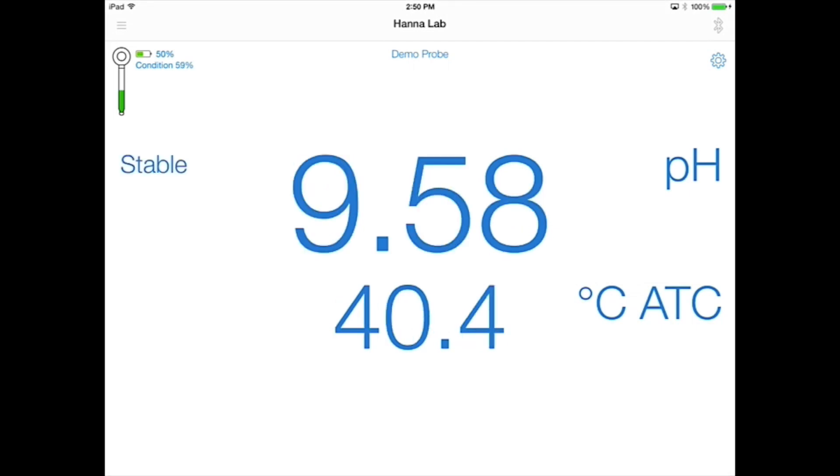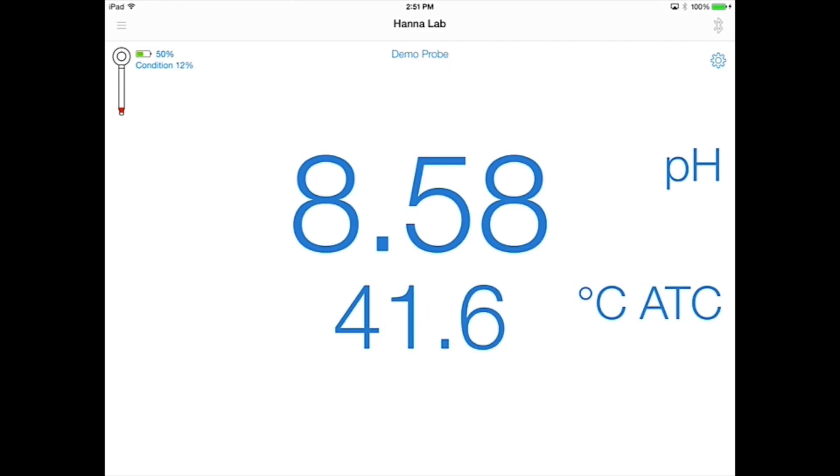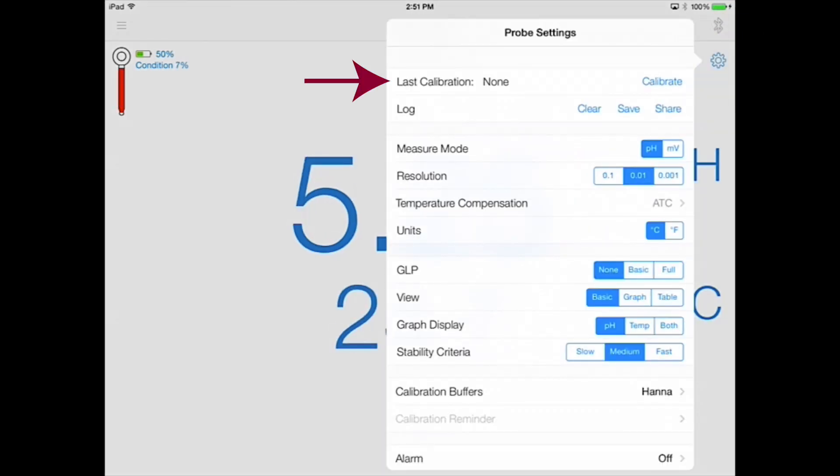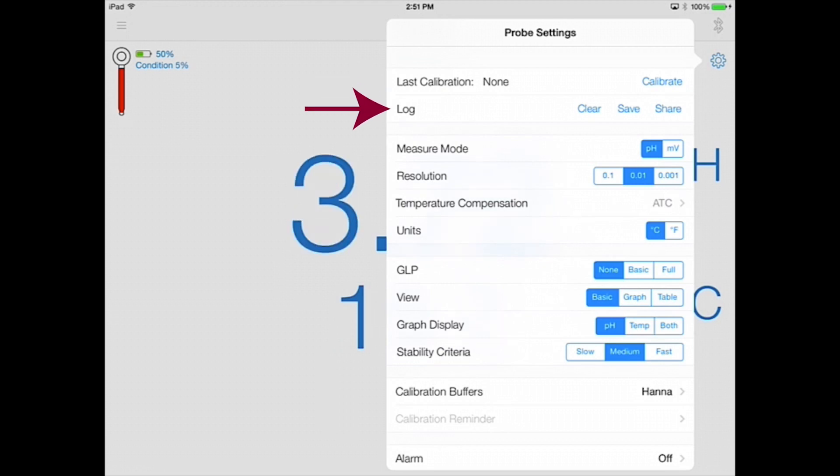When the reading is stable, the stable field will appear. Tap the gear icon in the top right corner of the measurement screen to access the probe settings menu. This is where you'll calibrate your electrode and save and share the data log.